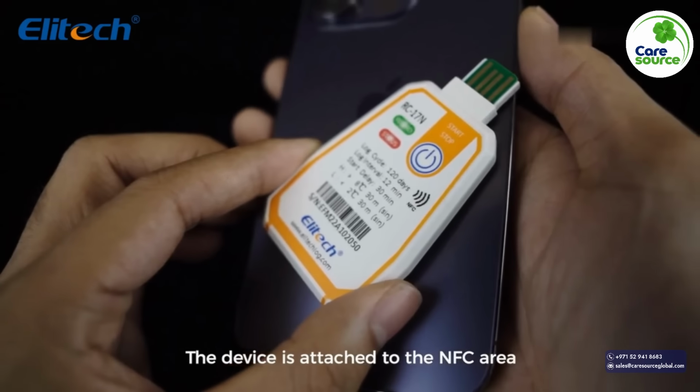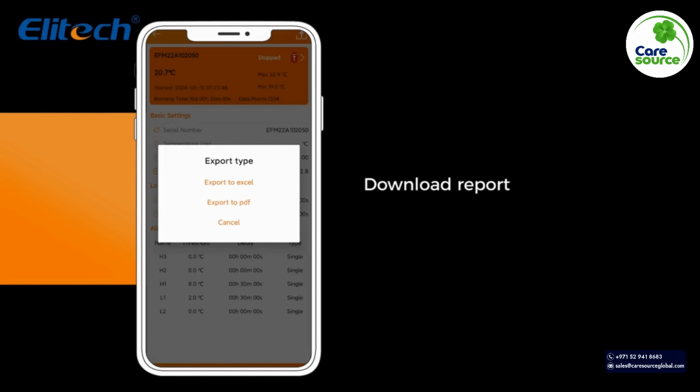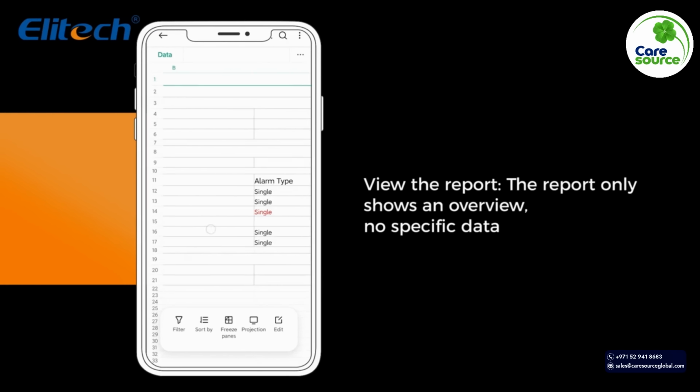The device is attached to the NFC area. The app recognizes the device. Download the report. View the report. The report only shows an overview, no specific data.